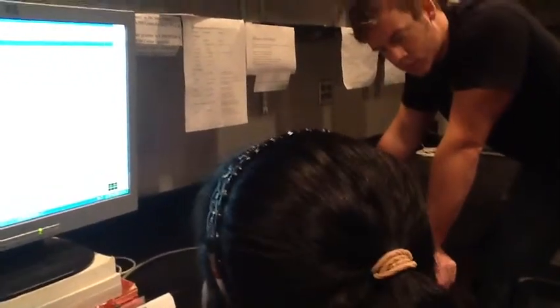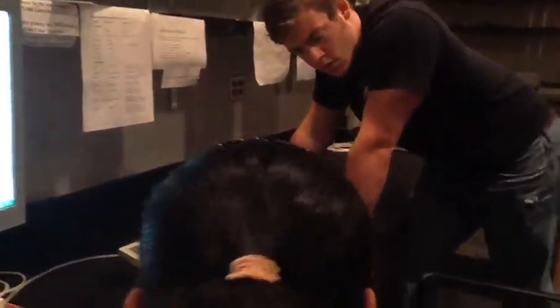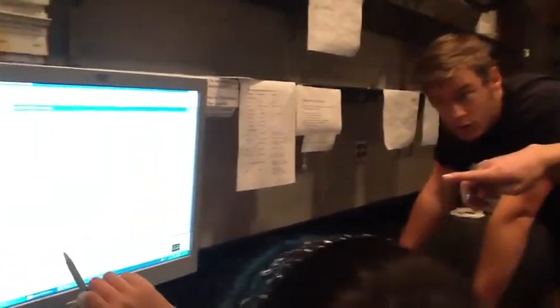So my question is, can you qualitatively tell me how much of each you have in your sample? Maybe. Well, in an NMR, you should. Furthest downfield is like double the height.